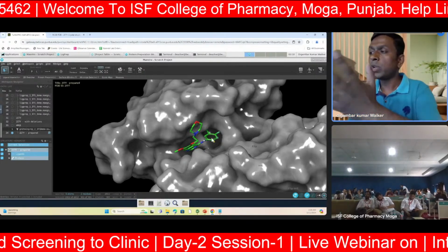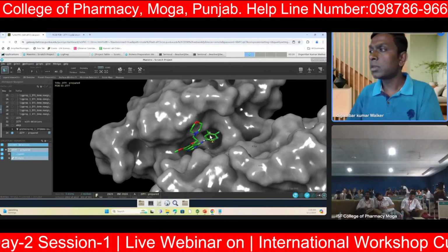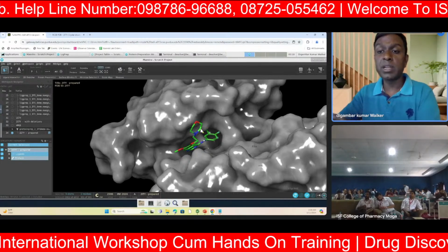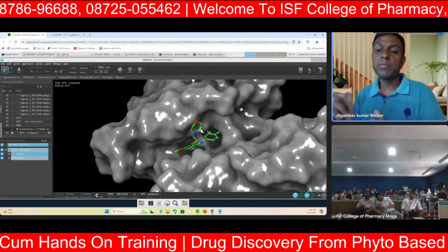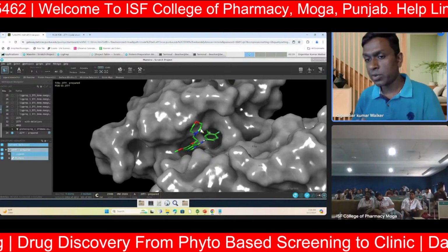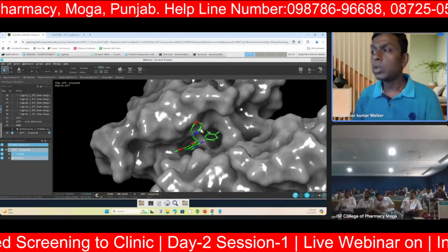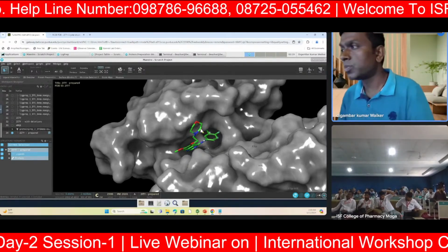Now here you can see, for this interaction, something is going into these two pockets, this pocket and this pocket, and something is coming out of the pocket. You can imagine that if you are getting a similar binding pattern, that molecule may give you the same physiological response, but it is just computational calculation. It is not necessary that if you are getting good ligand protein interaction, you will get good biological activity. It's not sure. This is just prediction. It can give you or it cannot give you the biological response.